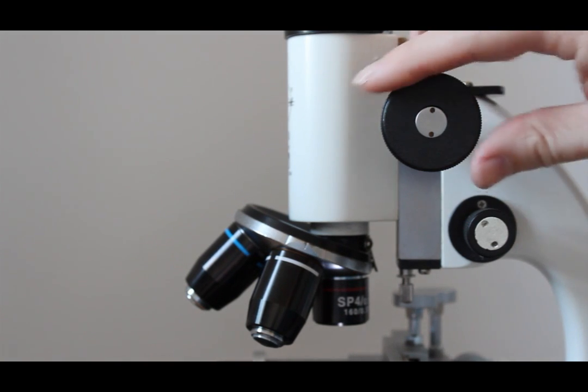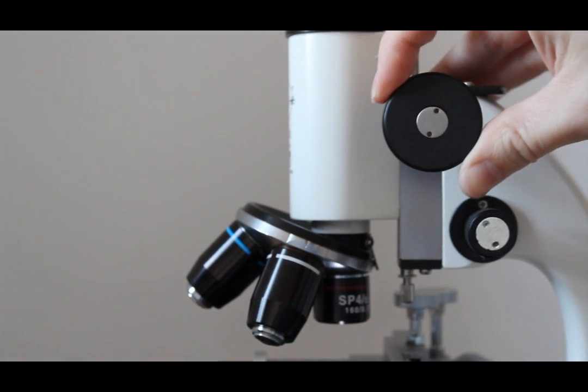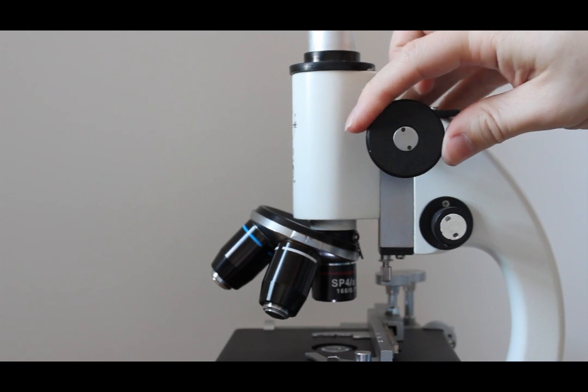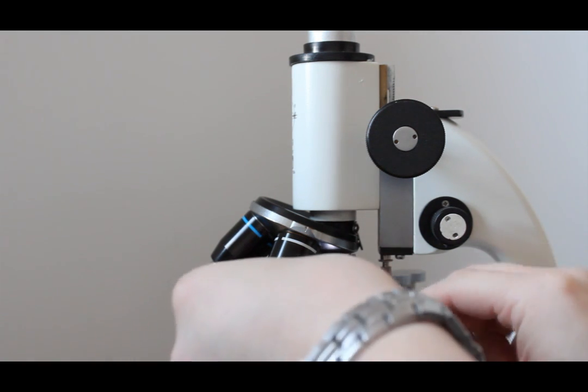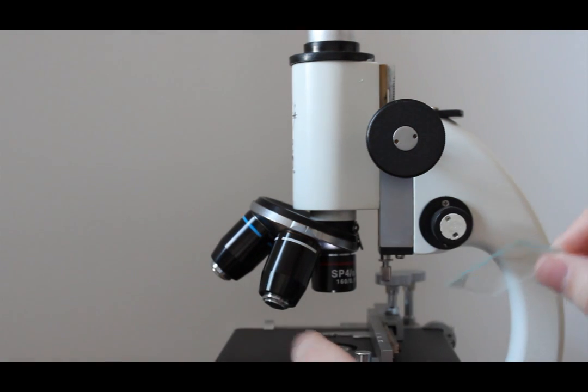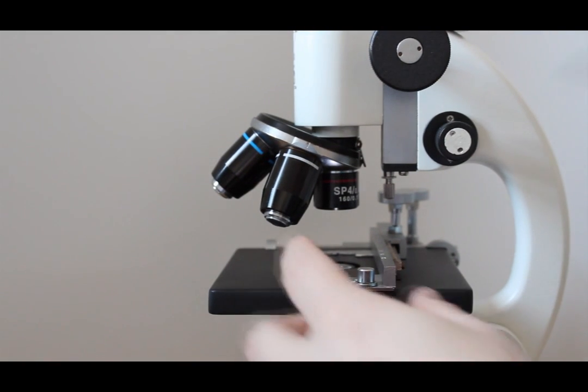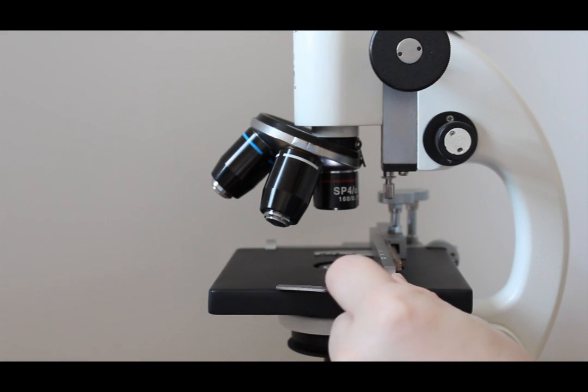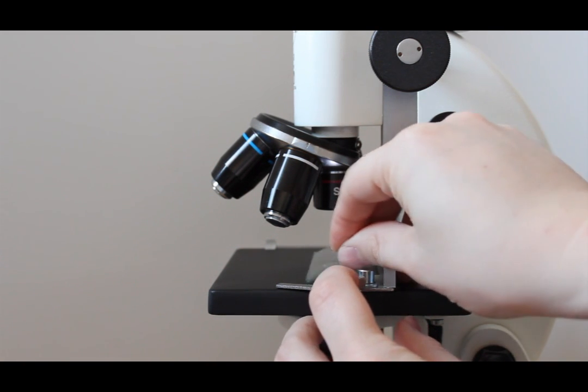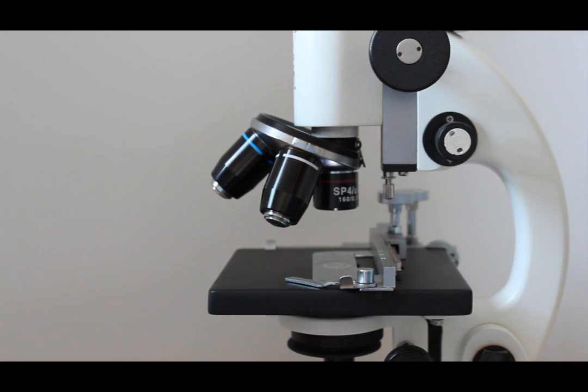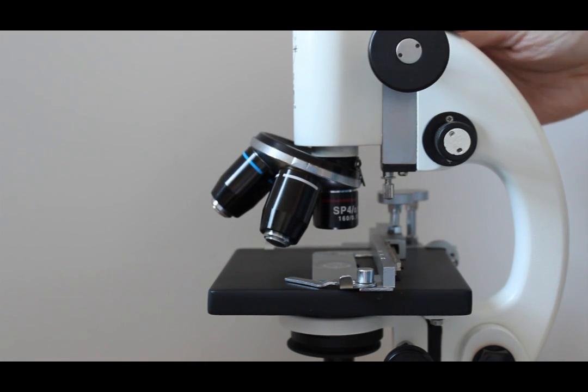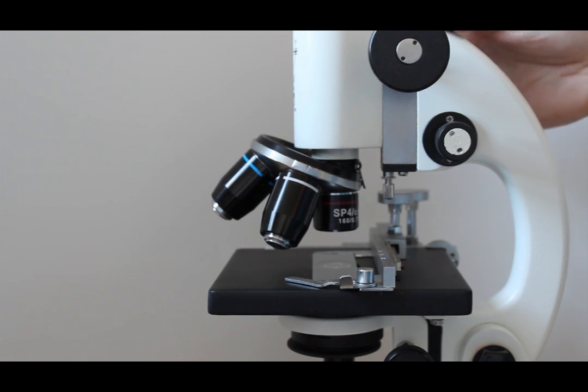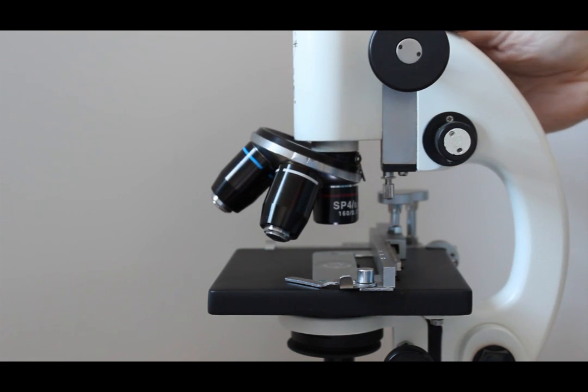The next thing we're going to look at is your course adjustment here. Course adjustment is basically when you first put that slide on. So you're going to put that glass in. And you're going to use your course adjustment to basically get a rough idea of where you want to be. As you can see it's moving quite nicely.